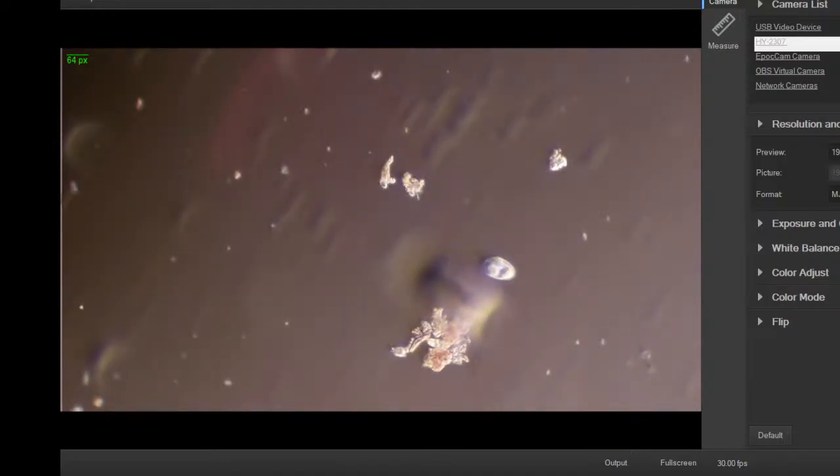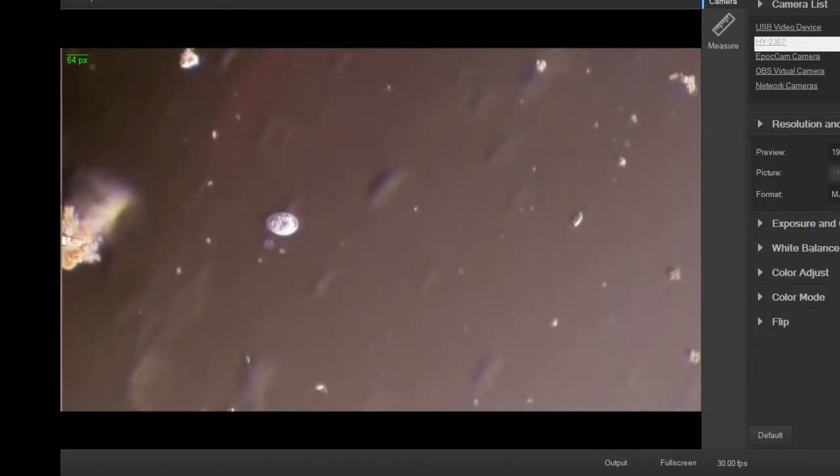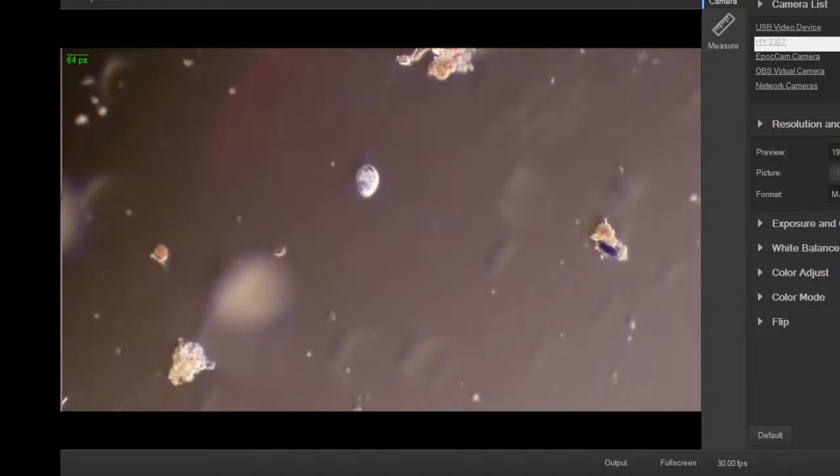Yeah. Well, Rich Hilton was on one of the ones I was doing when I was sick. I had a flu, and I put some of my nasty yellow green mucus on there that I had coughed up, and that was quite a show. People were checking that out. Didn't quite know what it was until I told them. A lot of dead cells in it. Tons of bacteria, of course. Doing a little Brownian motion dance.